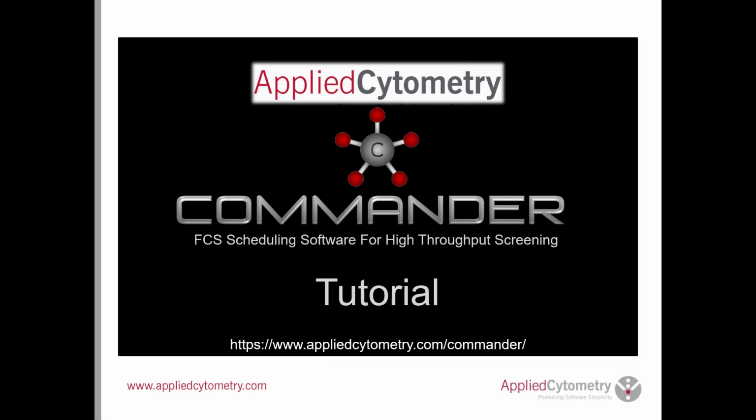Hi, I'm Jo Crofts. Welcome to the Commander tutorial. This tutorial has been made to introduce you to Commander and help you get started using the software.